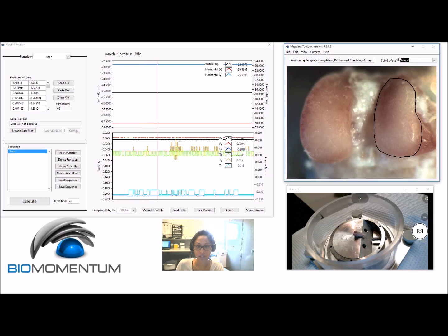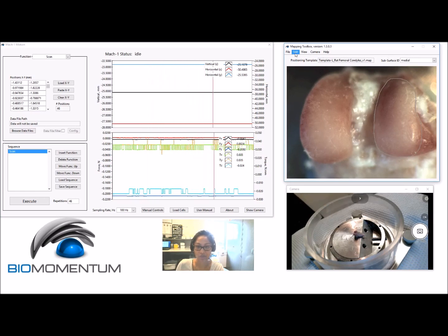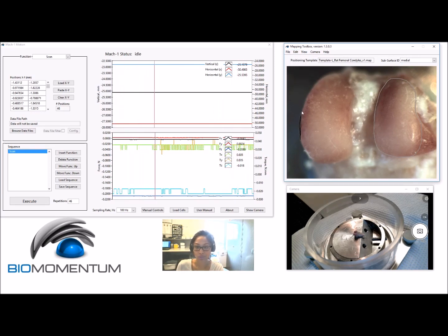It is important to edit or select a subsurface in the Subsurface ID field before adding a boundary, in order to assign the boundary to a subsurface.